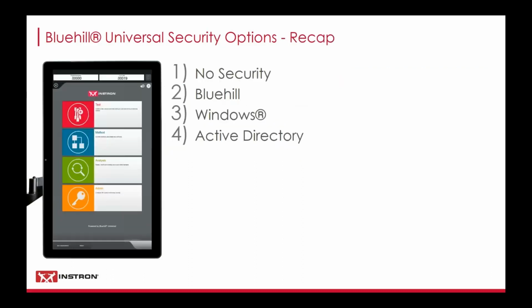So let's do a quick recap. For your security options, you could configure your system without any security, which depending on what your testing is, maybe that's the right thing for you if you're an R&D lab and you're making changes all the time and maybe you don't want to limit operators or you don't need to necessarily lock down the permissions.